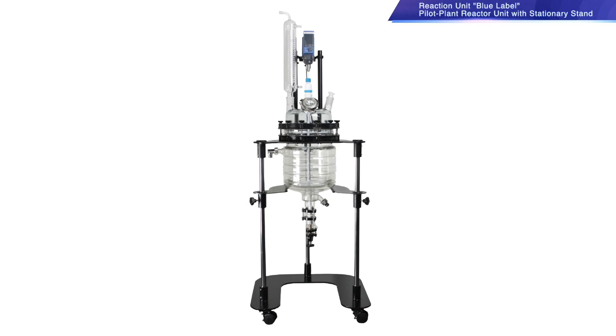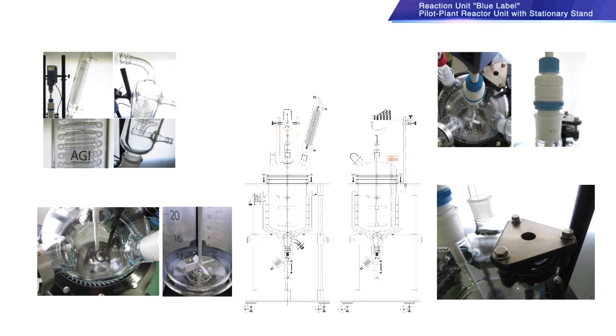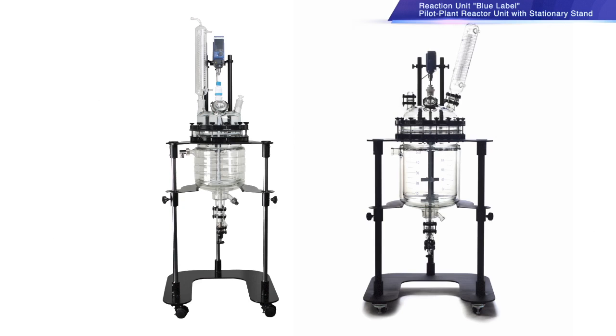This is the Blue Label Pilot Plant Reactor Unit with stationary stand. It is a simple and useful system as production ratios are in line with manufacturing scale, and consistent with shape ratio, providing adaptability according to the specific needs of our client. You can start testing quickly with this unit because the condenser, thermosensor pocket, and stirrer shaft are included. These units are fitted into an easily moveable, wheel-installed stand. This unit will be a good partner when you need to produce large samples in a laboratory.